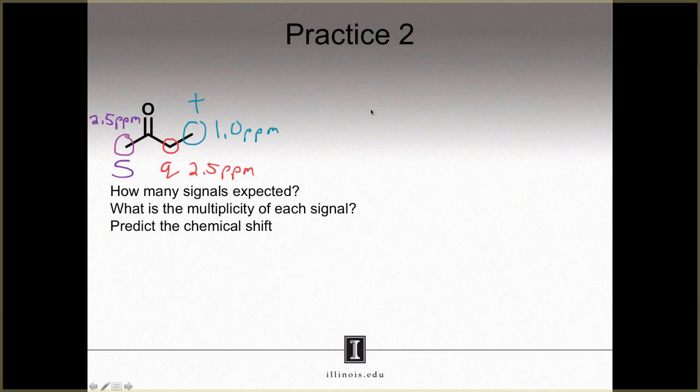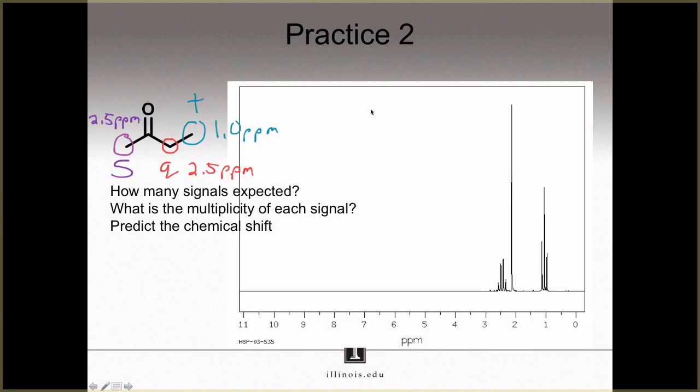Now let's see how our predictions match reality. The purple protons should appear as a singlet at roughly 2.5 ppm. Is there such a signal in that area? Yes, there is. I have a singlet at roughly 2.1 ppm. My prediction was pretty close. My red protons should be a quartet at roughly 2.5 ppm. How did we do there? Pretty good, actually. There's a quartet at almost exactly 2.5 ppm. What about the blue protons? I should see a triplet at 1.0 ppm. Excellent! I see a triplet at just above 1.0 ppm. My predictions were pretty accurate.